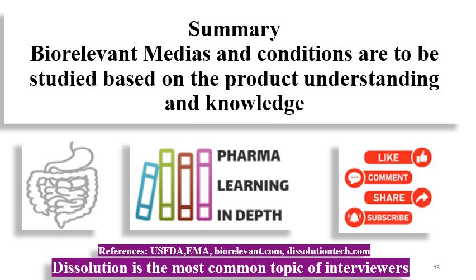Then what are the differences between biorelevant method, discriminatory method and QC method? Then what is the importance of the biorelevant dissolution and the media and their composition with the pH, and how the in vitro dissolution testing apparatus and these things can be used to make the biorelevant condition.